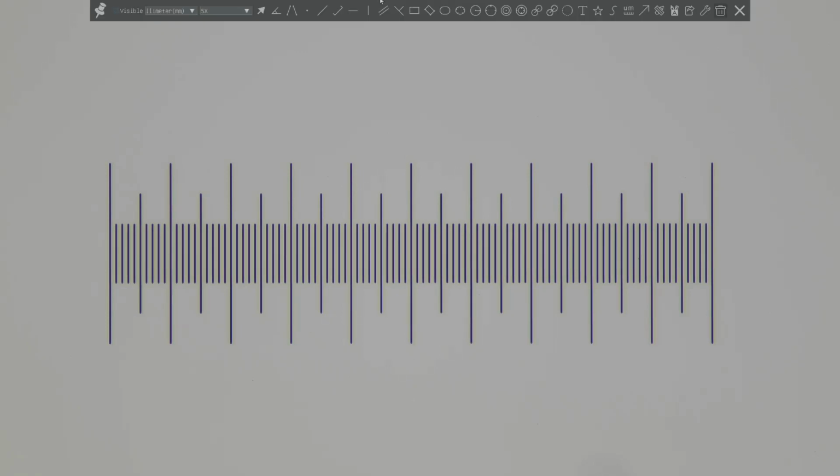This video serves as an overview of the measurement tools for the Path 4K and View 4K cameras when using the on-screen display or OSD in HDMI mode. Moving the mouse to the top of the screen, you will find the measurement panel. This can be pinned on screen using the pin button here. Moving to the right of there, we will find our units as well as our magnification selection.